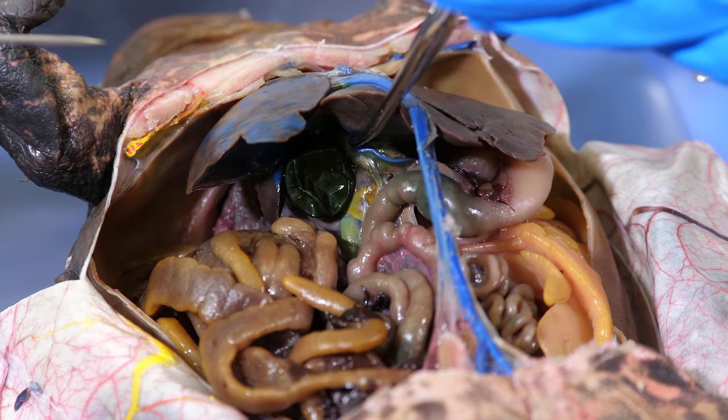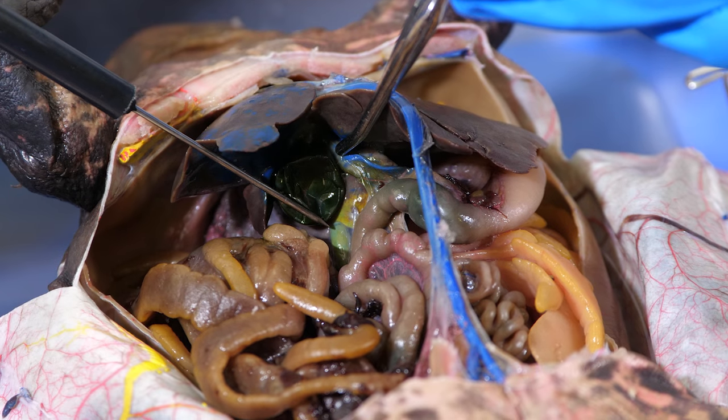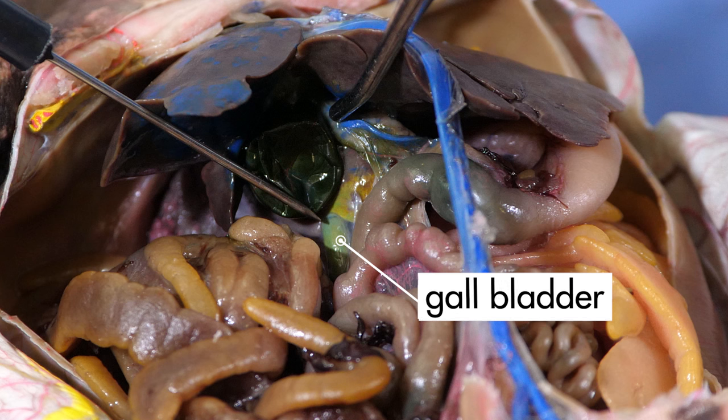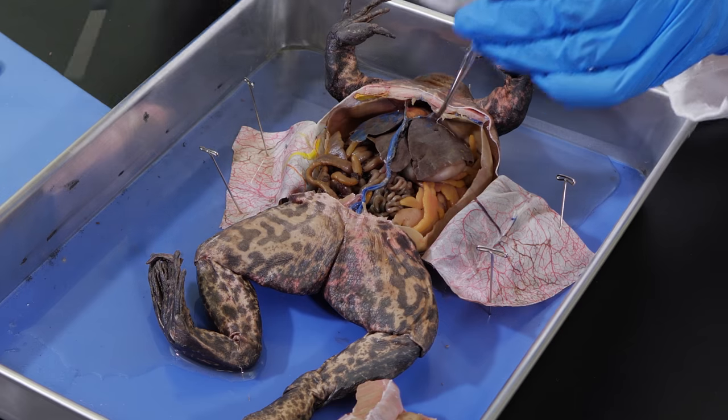If we lift up the right anterior lobe of the liver, we can see a small green sac. This is the gallbladder. The gallbladder stores bile and then releases it into the small intestine as the frog needs it for digestion.